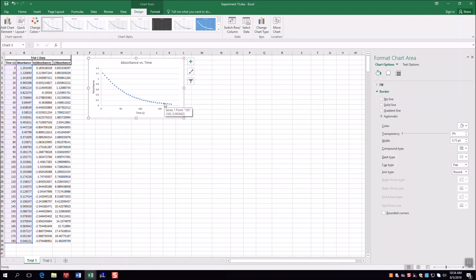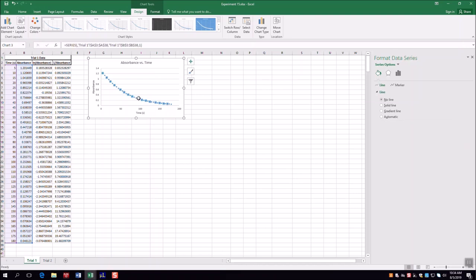Now, you've probably learned in your other math classes in the past that y equals mx plus b is the equation for a straight line. So if the equation that we're using is actually applicable to the dye, we should get a straight line, because the equation that is correct should relate to it via a straight line. So how do we check straight lines? Well, as you've done before, we're going to need to add a trend line for a linear regression and check how close the R-squared is to 1.